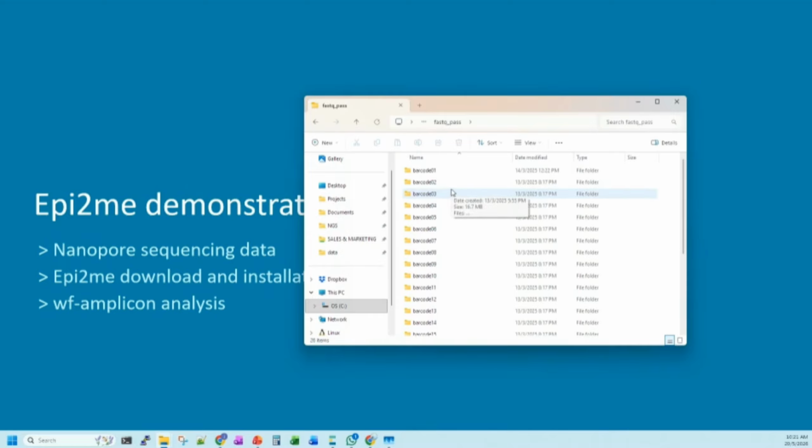So during the sequencing, we can set it up such that real-time basecalling and real-time demultiplexing can happen. So after we get the data, all have been separated into samples or different barcodes accordingly. So we do not need to process the raw data in order to do the demultiplexing to get the data for each of the samples.